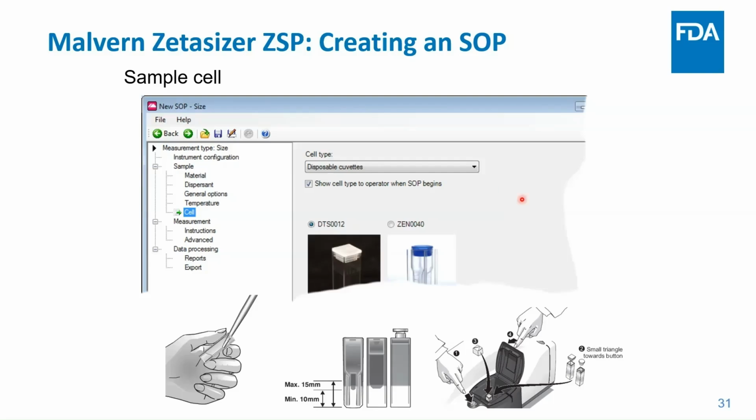they're using. Also, a cuvette can have some interaction with the analyte in question. So, some plastics or glasses have different interactions with different materials. So it's just something to keep in mind when you're designing or looking at a person's experiment. What cell type are they using, and are they reporting it?